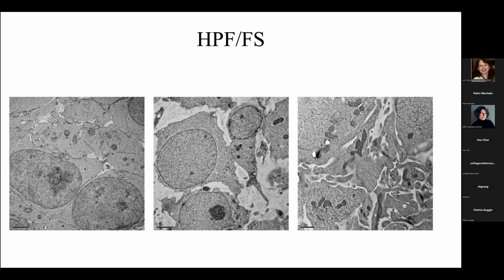And here you can see a bunch of them in this field of view, the slice still maintains that presence. We actually see extracellular matrix components starting to form, which is really cool because, at this developmental age, that would just start to happen. So it was really neat to see these things in a cell and preserve this cellular fidelity using high pressure freezing and freeze substitution.